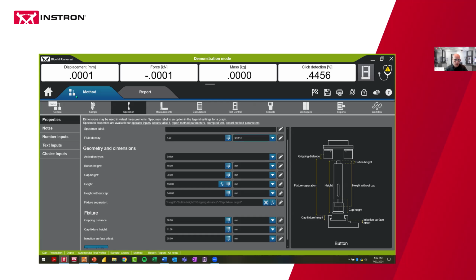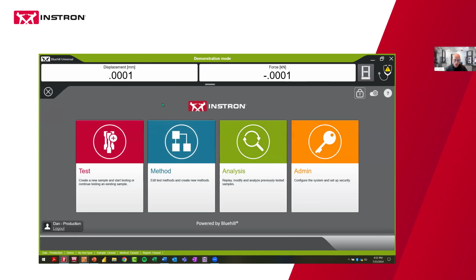So that is the two method types that we've introduced. And in the introduction to the system, again, there's going to be a lot more detail associated to seeing one of those tests actually run. And so I definitely encourage you that if you are interested, to not just look at this video, but to look at the other resources that we'll have for those systems.